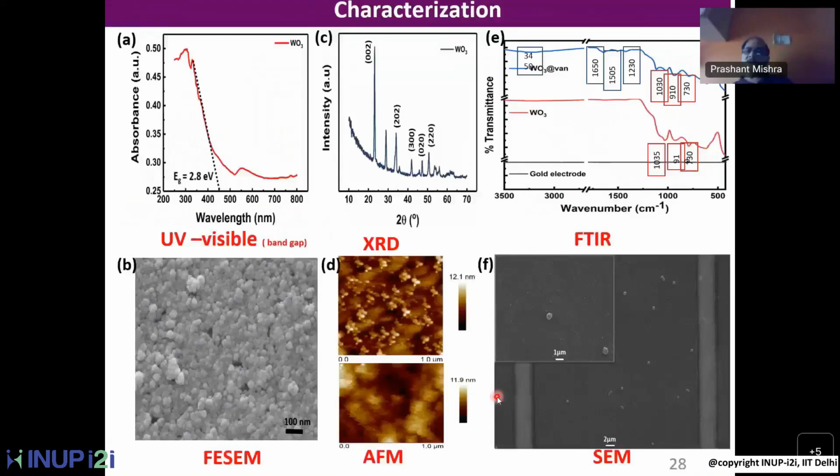So here I'm coming back to the lecture. What you do is you make the sensor, and as you may have learned about UV visible spectra, you do it for band gap energy.